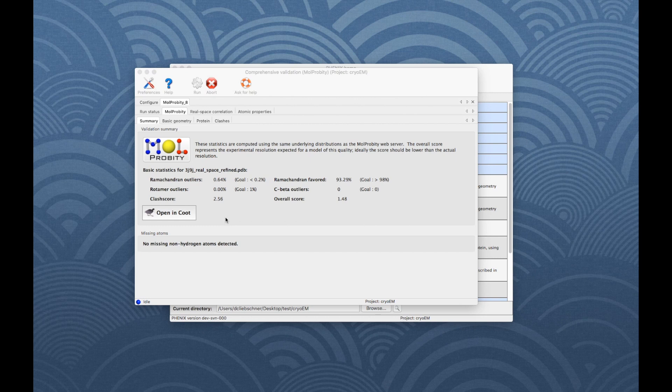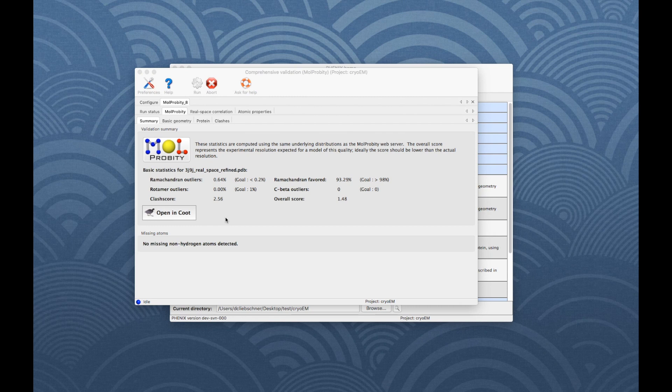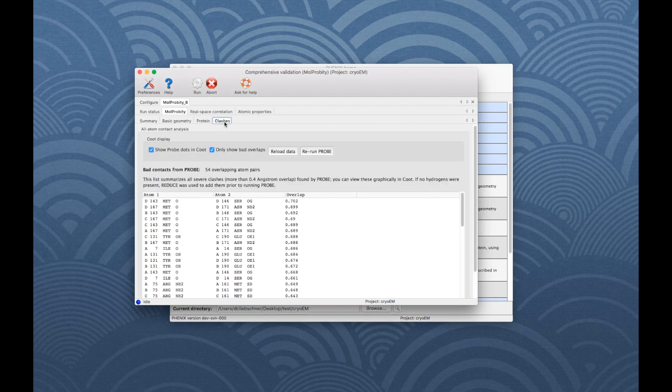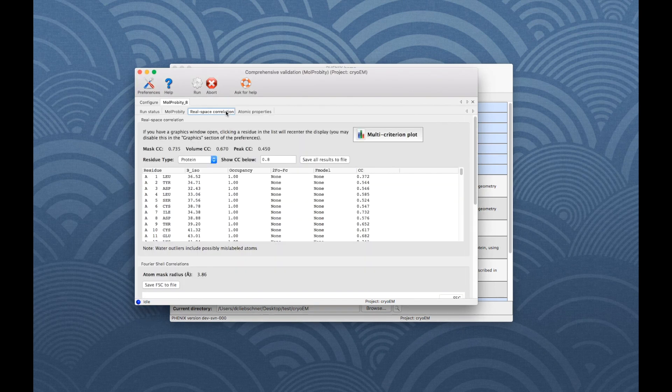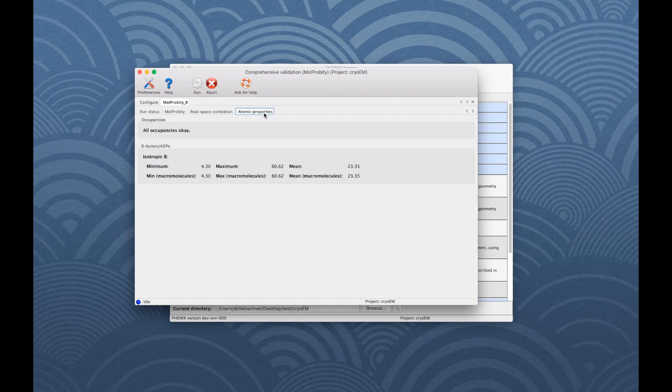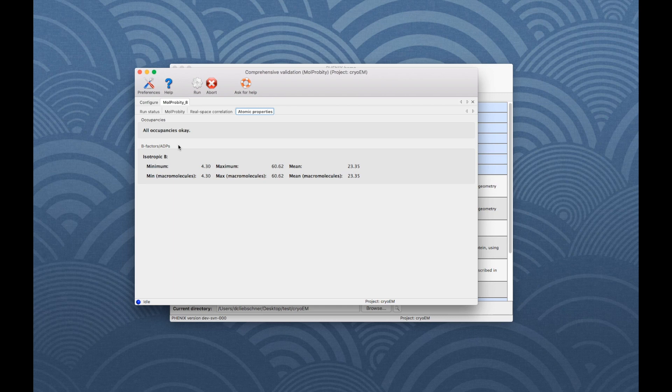When validation is finished, three new tabs appear. The MolProbity tab includes a summary and detailed validation results. The Realspace Correlation tab shows correlation coefficients. The Atomic Properties tab shows sanity checks such as for occupancy and b-factors.